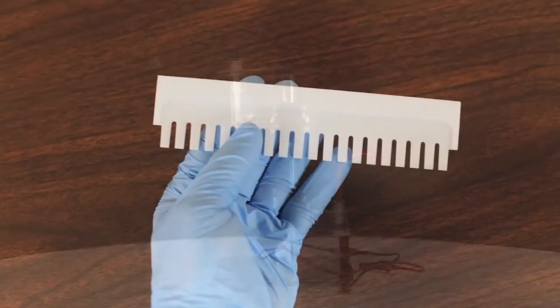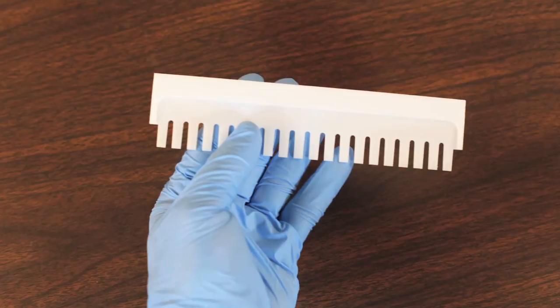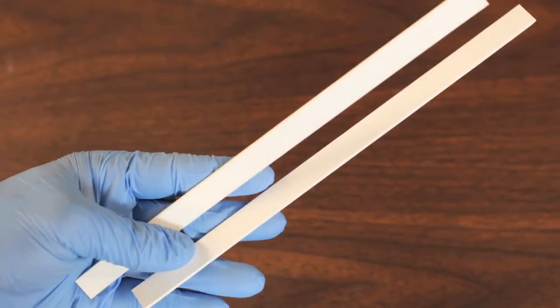The system ships complete with 1.5 mm combs and spacer set. Optional combs are also available.